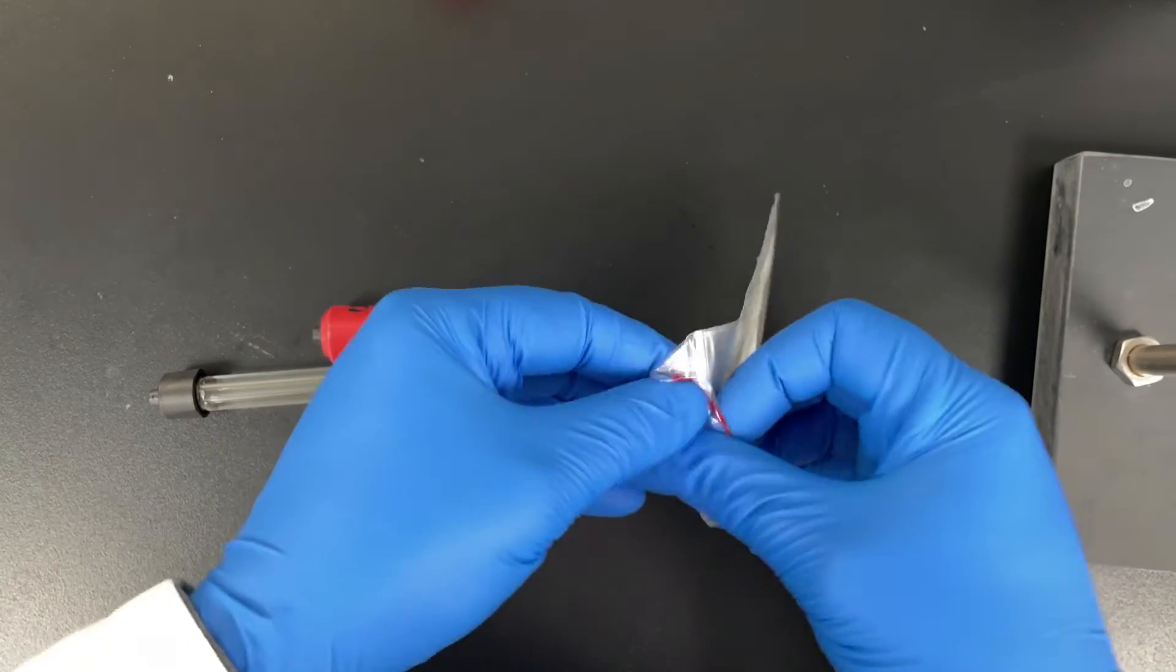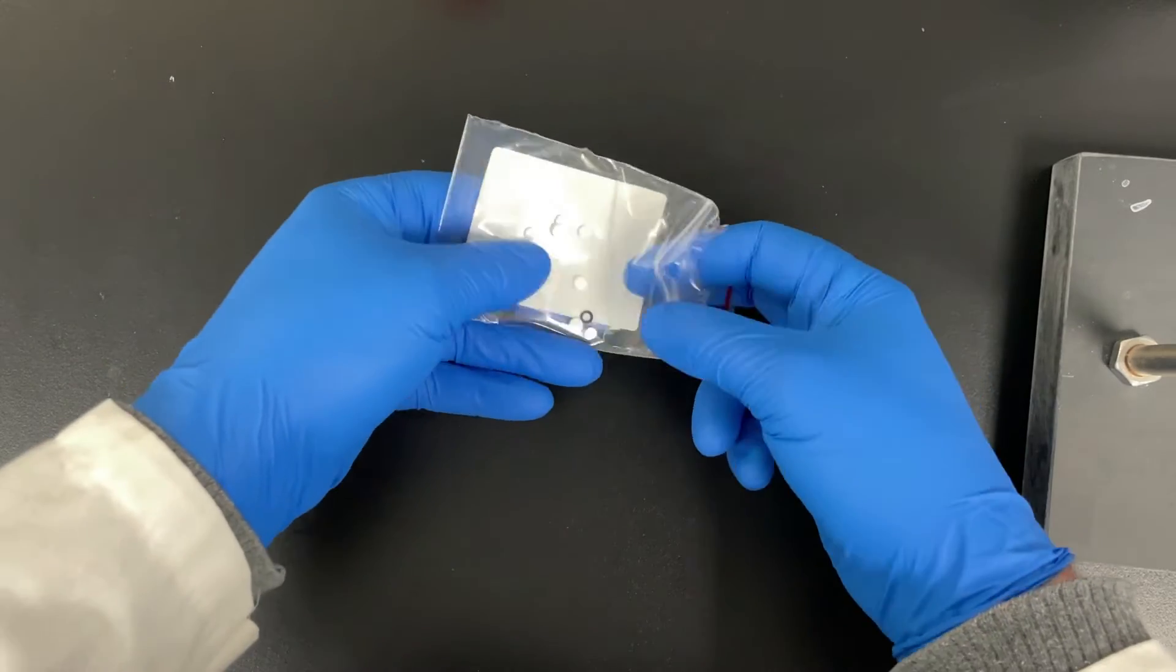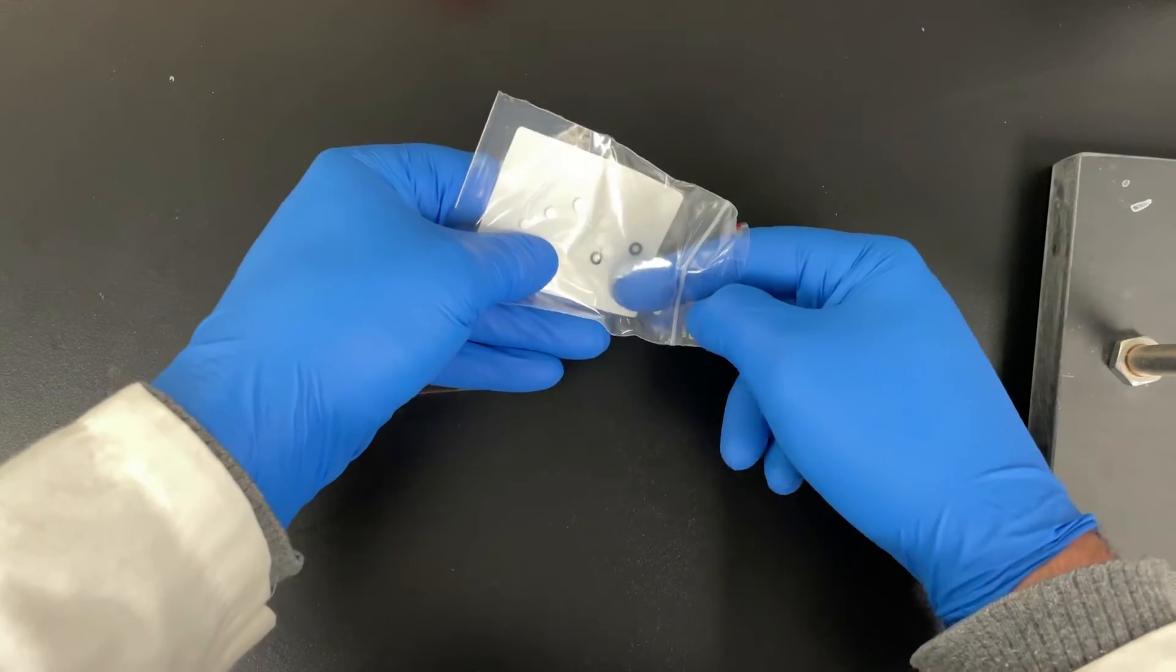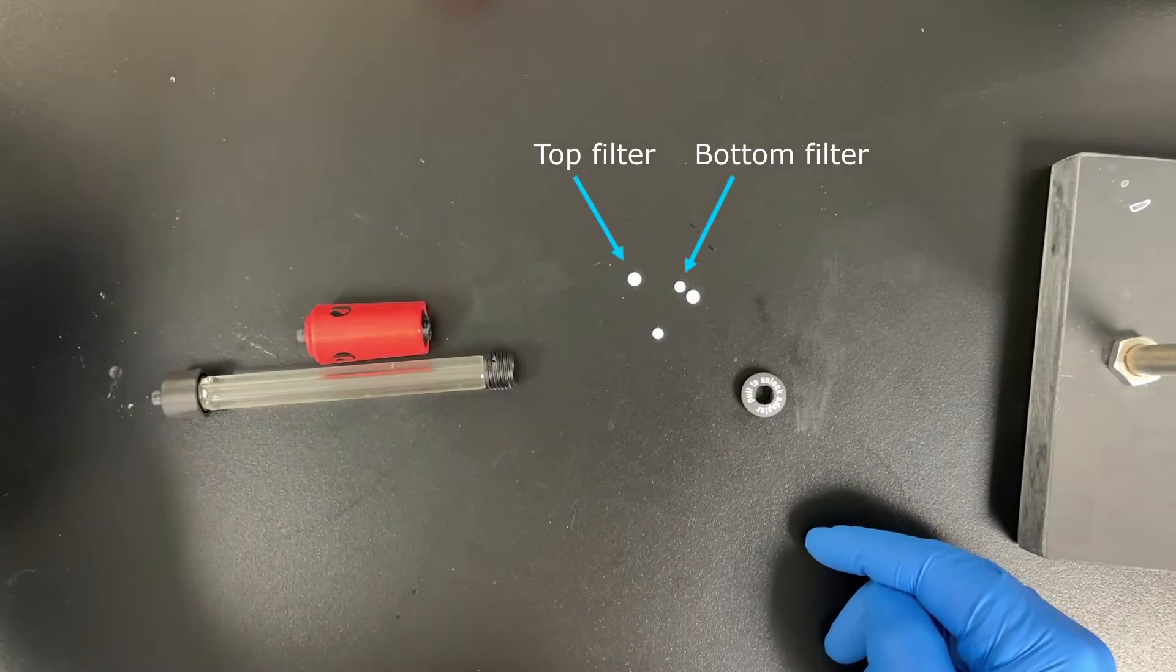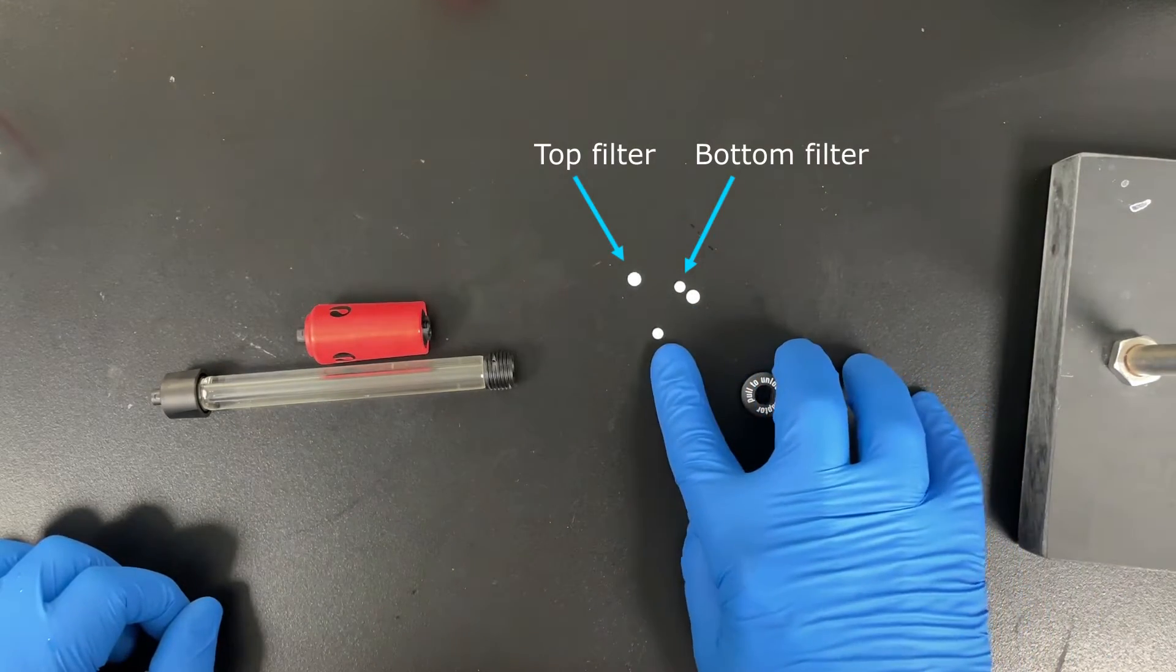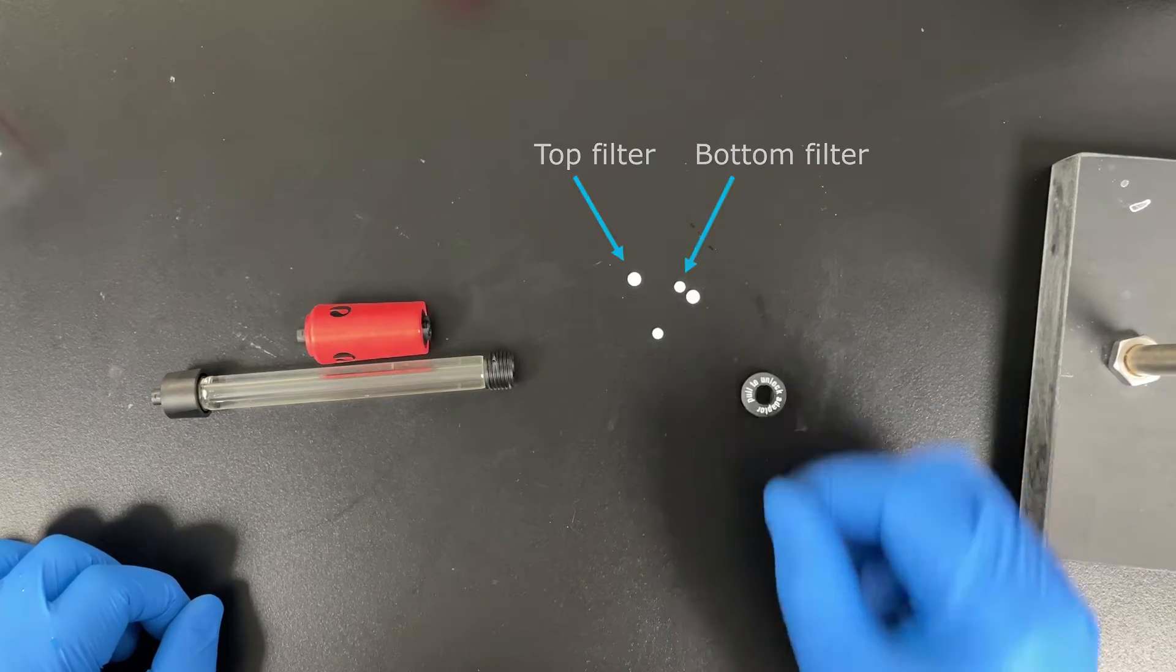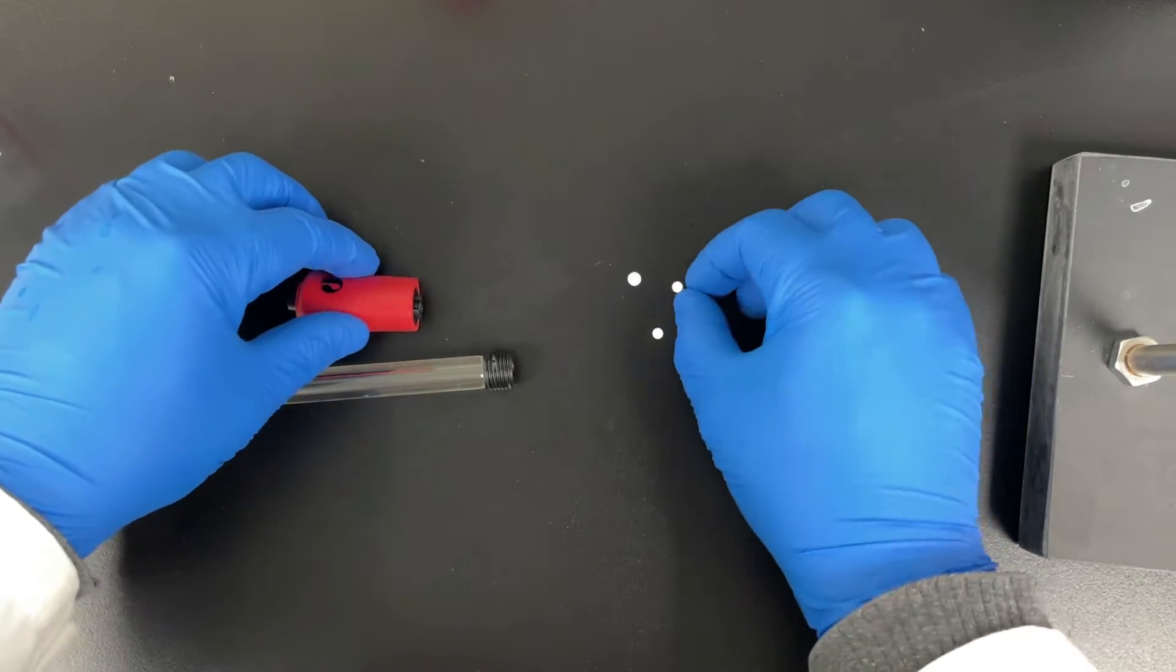So there are two sizes of filter that hold the resin in place and you can see it once you line them both up together. The larger filters fit on the top adapter and the smaller filters go on the bottom adapter. These things are pretty tiny.